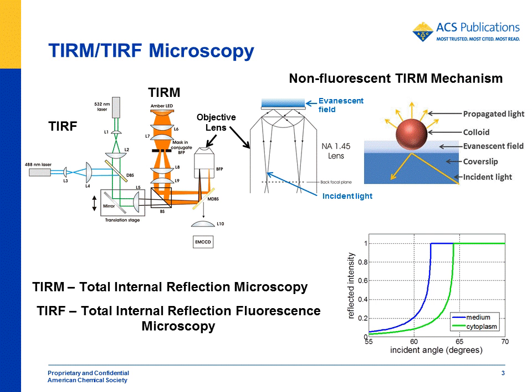The label-free mode is thus sensitive to the presence of objects, for example a colloid or a cell membrane, which impinge the evanescent field. In general, the image will appear darker as the cell membrane approaches the surface of the substrate. We've also added a fluorescent arm to the microscope through the addition of a total internal reflection fluorescence channel, also known as TIRF. In this present work, we describe the application of this combined TIRM-TIRF microscope to visualize label-free colloidal particles close to the cell membrane and study their internalization in a living cell.